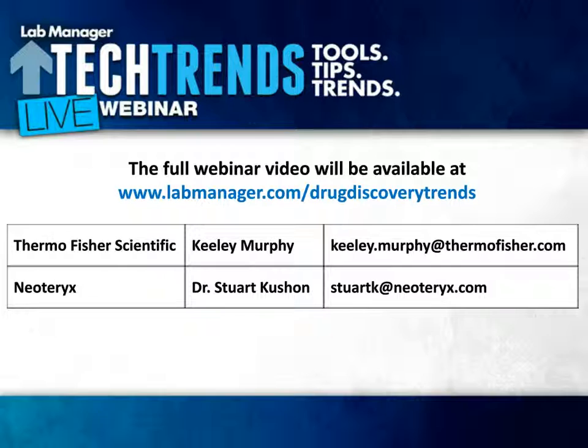Great, thank you. Keely, why is mass accuracy important, and how often do you need to calibrate this system? Good question. The mass accuracy is important because it allows you to obtain a very high degree of confidence for the data that you're collecting. By having a good mass accuracy, you're able to really narrow the mass range that you use to generate your chromatograms. This will improve data confidence, it will eliminate noise, and it really helps you to be sure that the signal that you're integrating as part of your chromatogram is due to your analyte of interest and not due to some background noise or other interference.